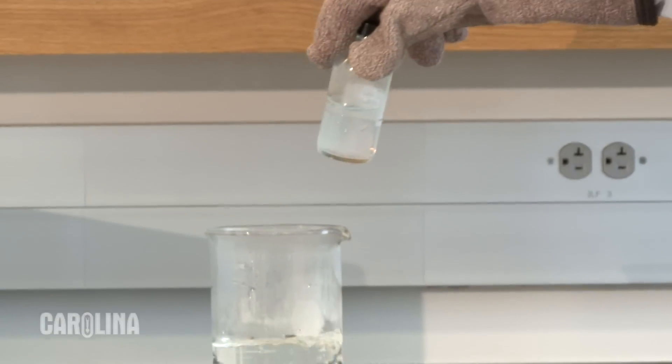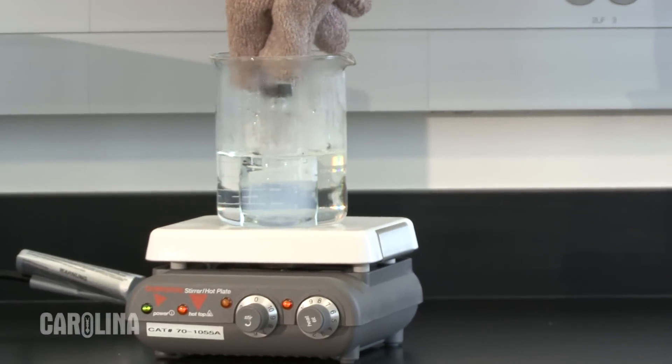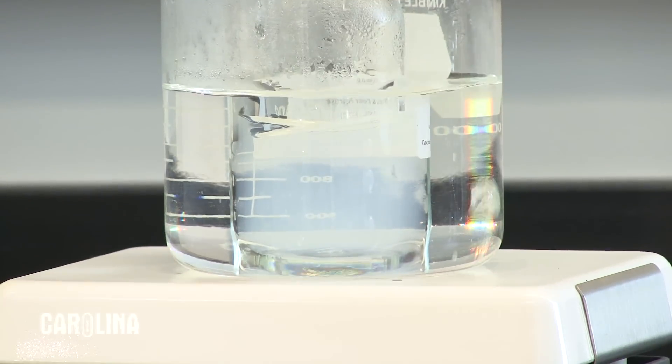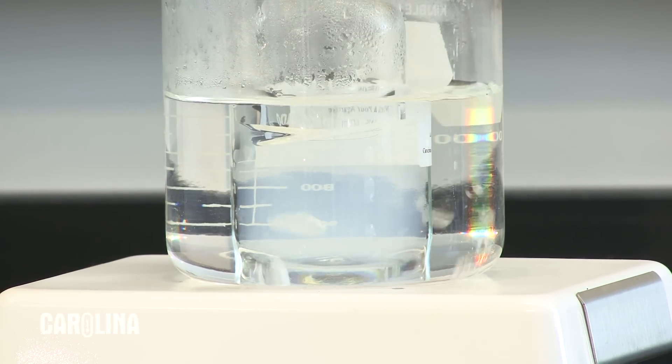You can also melt the agarose in a boiling beaker of water on a hot plate. Make sure the water comes up to the level of the agarose in the bottle and loosen the cap. Agarose melted in this way takes longer to melt than agarose does in a microwave.